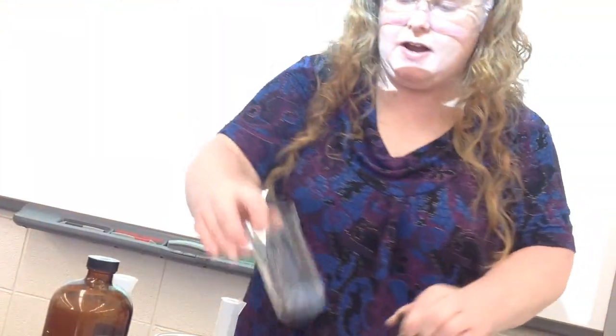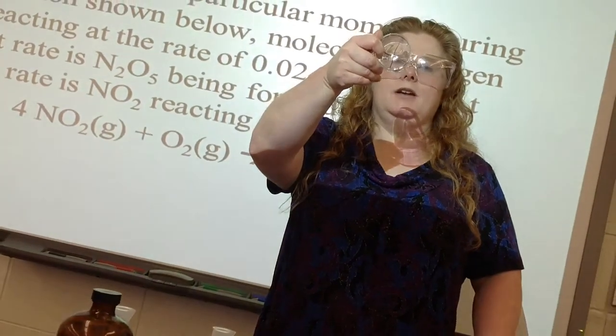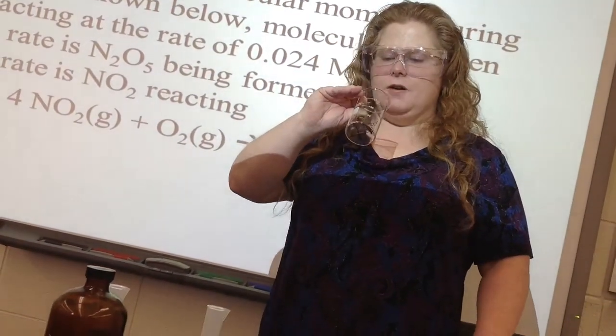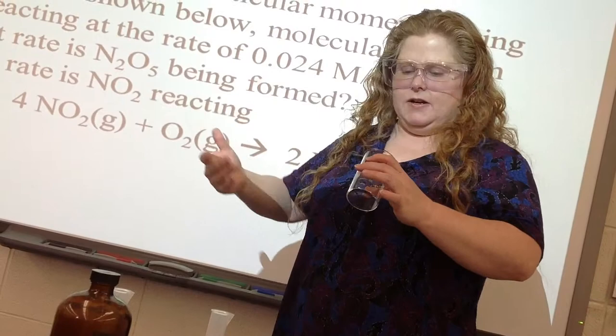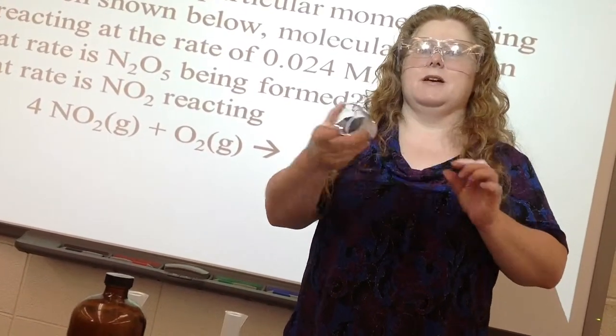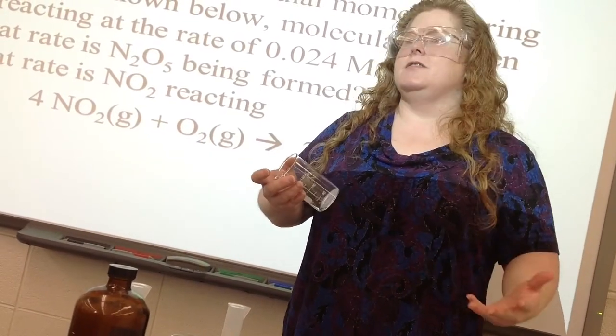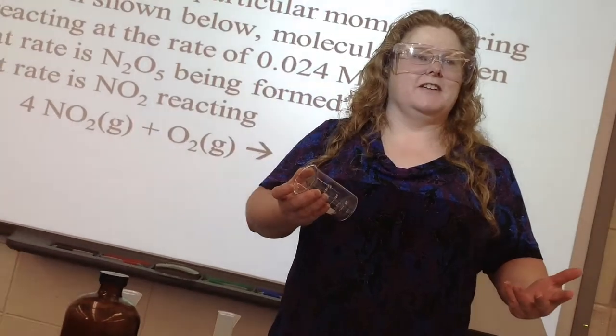And actually, I have some beakers here that I'm going to use. I put an X on the bottom, and what I'm going to do, I'm just going to have Savannah time from the time of mixing until the time I can't see my X anymore. And we're going to just see if concentration really does make a difference.